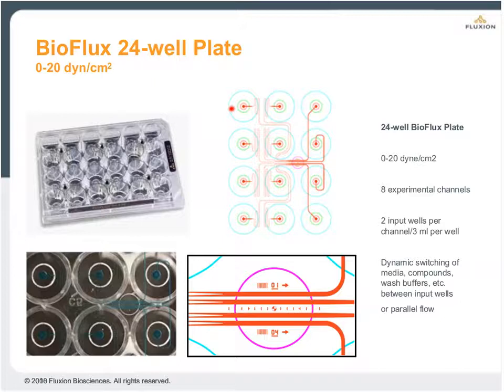You can see each channel has 2 inlets and 1 outlet. And if you look down here in the middle where I'm pointing, you can see that the 2 inlets meet inside this area called the viewing window, and you can see that you have 4 channels ganged together.